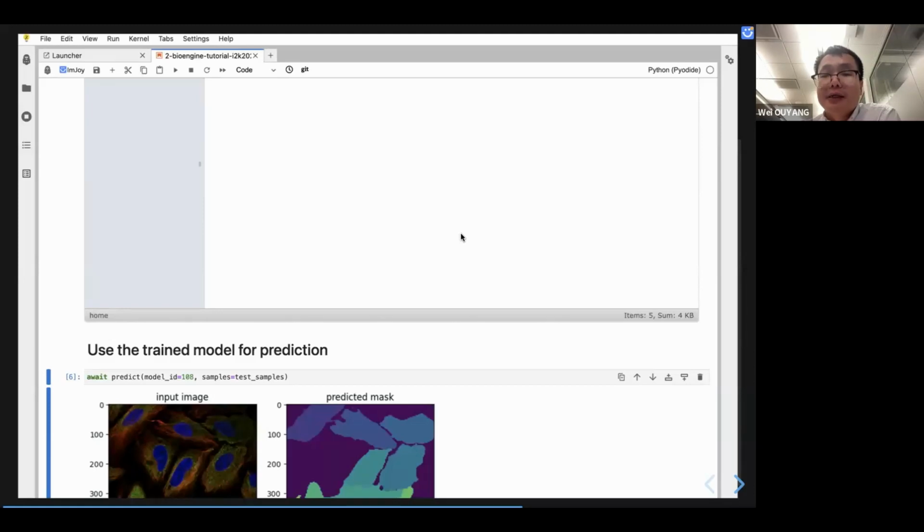I see that there's a question about any plan for including microSAM. Yes, actually last week we were in this hackathon with the AI4Life consortium. Konstantin, who is the leader of the microSAM team, and we worked on a small project to deploy microSAM to the server. However, because we are currently limited on GPU resources on our local server, hopefully we will have it soon available in the BioEngine. We already converted the microSAM encoder and decoder to the BioEngine compatible format. We have tested it locally, but it's just not there yet. It's mostly because of computational resources.